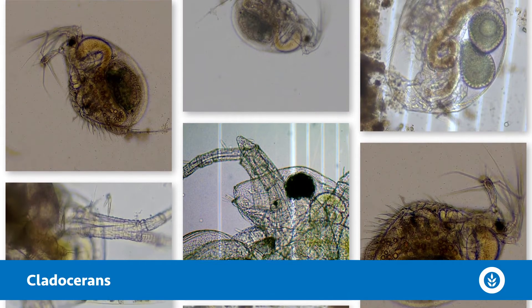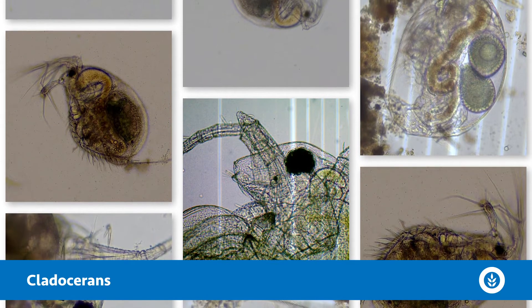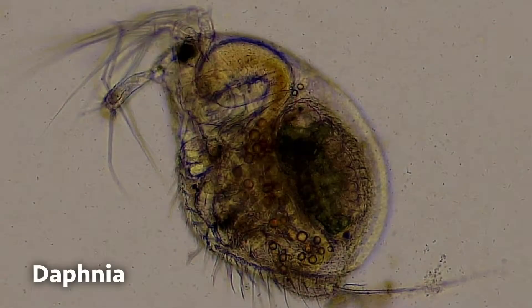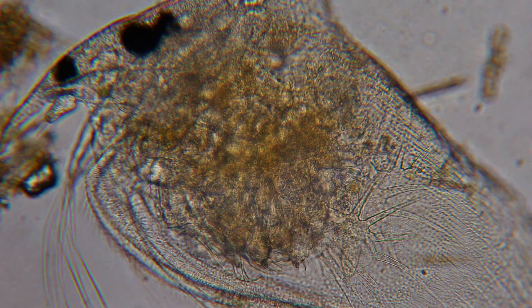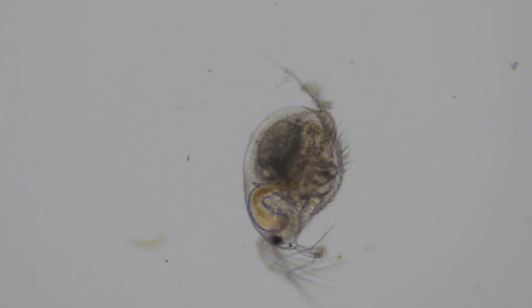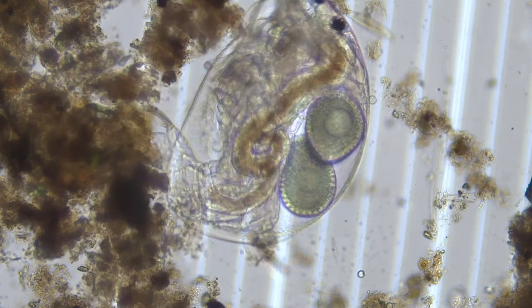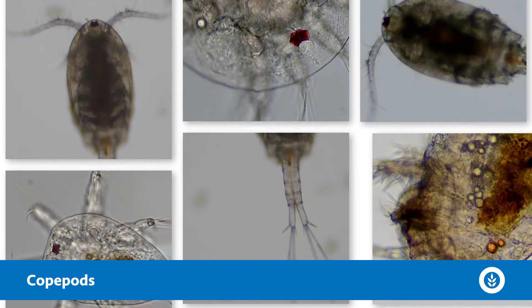Next up is another cladoceran — an order of classification, and they're also crustaceans, tiny little arthropod animals. There are about 700 species, up to five millimeters in length. The common species I see are Daphnia, very common in water resources, and Bosmina. They're sort of flattened with a see-through carapace and they bounce around in the water column, filtering out algae, bacteria, and detritus — about anything they can fit in their gullet. A very cool group of invertebrates.